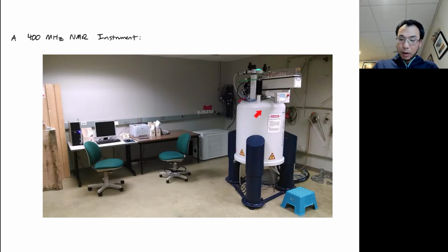The samples are all put in by a robotic system into the inside of this shield, inside this magnet. Around this magnet are some coils, and those coils generate some frequencies through these wires underneath here, which are connected to this white box in the back. This white box is where the radio frequencies are measured and detected. And of course we have our computer here to run everything.